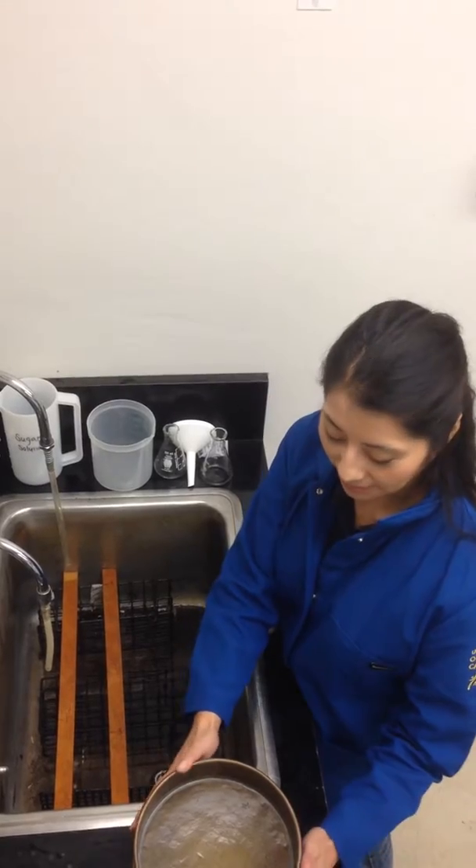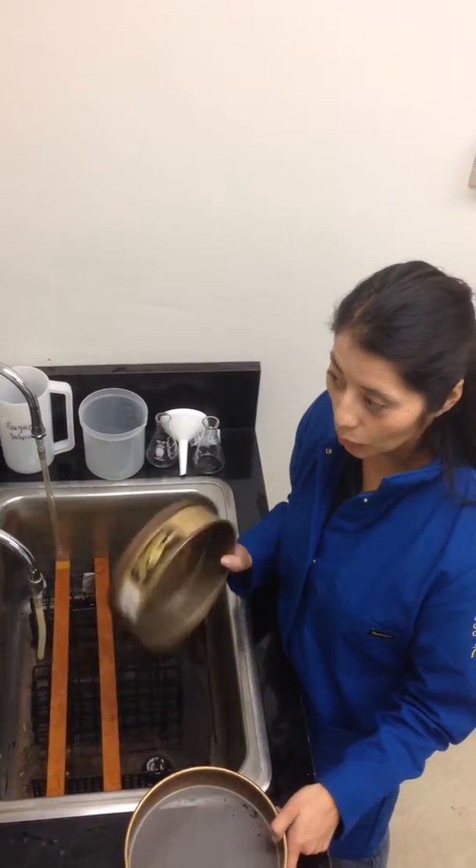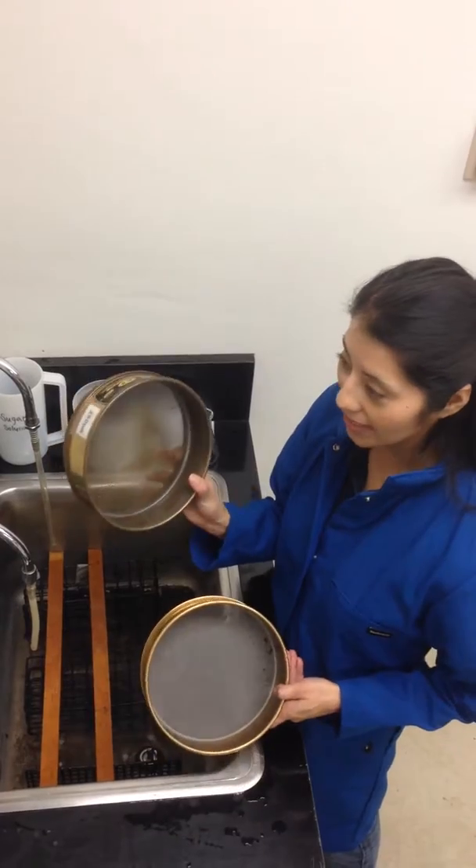Hello, today I'm going to demonstrate how to sieve soil to get sclerotia. Here I have two sieves, a coarse sieve and a fine sieve.